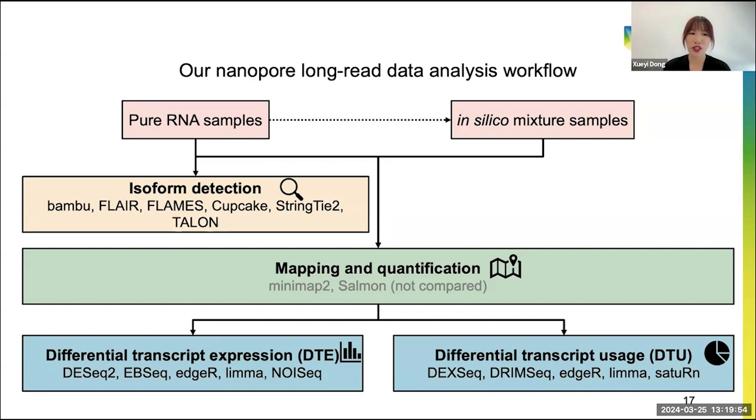And we aligned our pure samples and in silico mixture samples to the reference transcriptome and performed quantification based on the reference. Then we performed the DTE analysis using 5 different tools, and also compared 5 DTU tools. Then let's go and see the results.